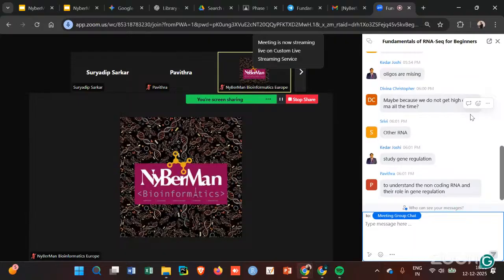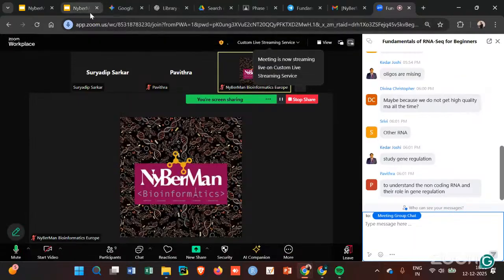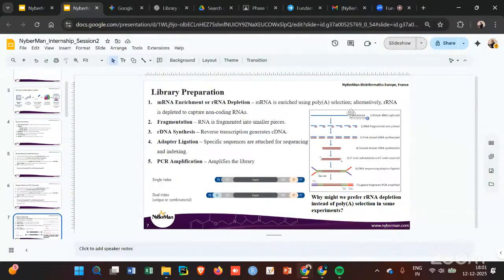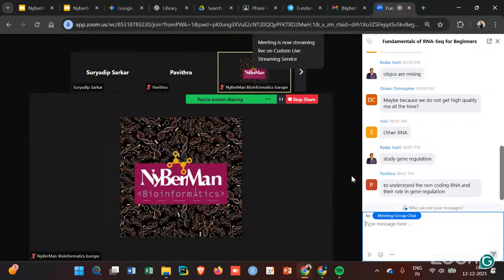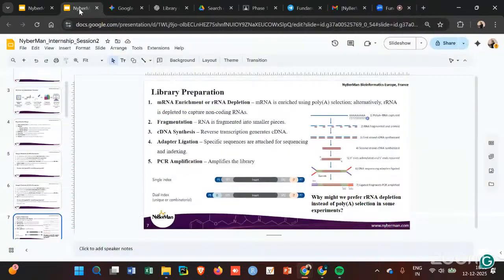If you also want to study the non-coding RNA, you would end up using ribosomal RNA depletion, because then you can preserve and capture the non-coding RNAs as well. Okay. Any further questions? Can you please give me a thumbs up if it's clear till here? Okay. Let us go ahead.